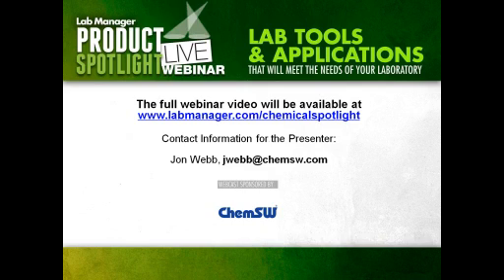Sure, absolutely. And then how do you know, using this tracking system, when a chemical is used up or whether it has been disposed of? Somebody has to physically go in there and enter that information, correct? Can you repeat that question, Tanusha? Sure. How do you know when a chemical is used up or it has been disposed of?